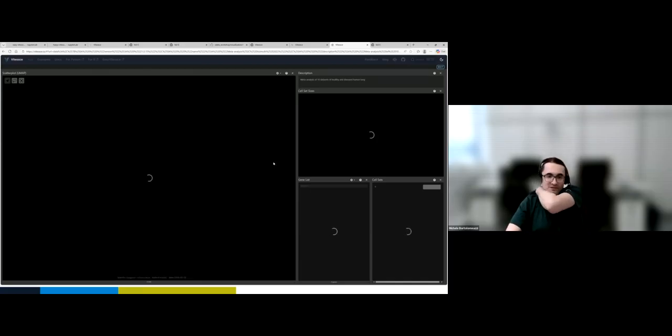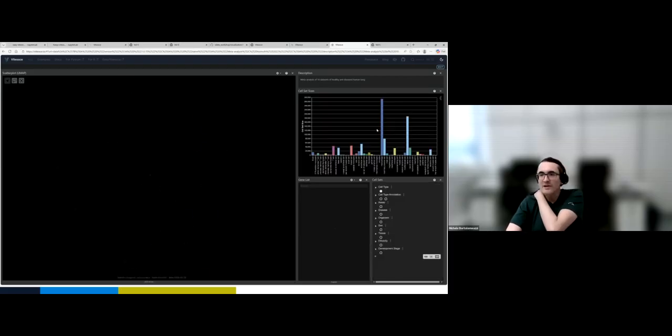Let's see if it loads quickly. If not, maybe this is something that you can try yourself directly from there.